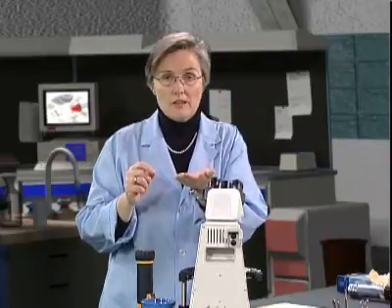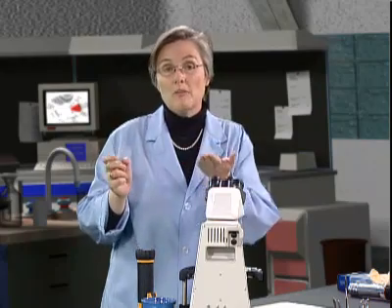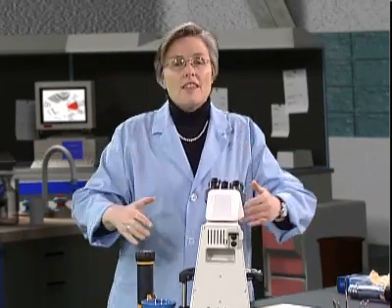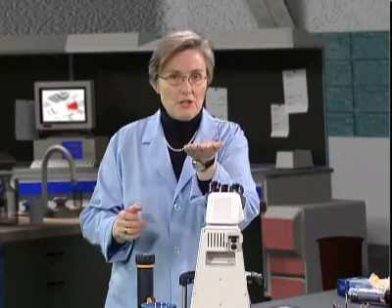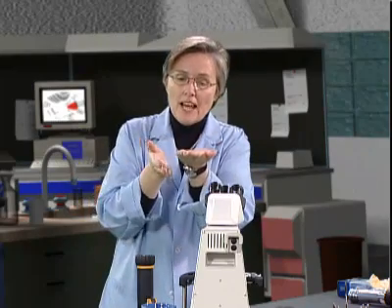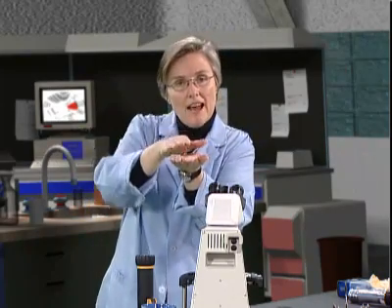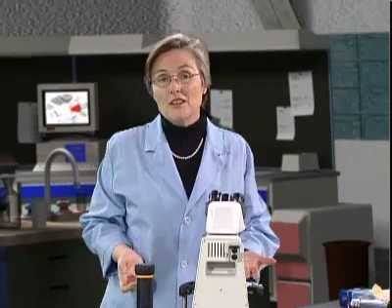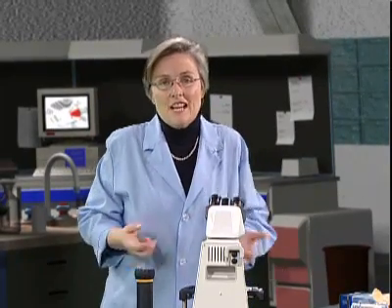Cyanoacrylate, or superglue, when it hits the air, polymerizes. And when something polymerizes, what it does is it rapidly repeats basic units. It forms a plastic. So think about this. We have oily residue on a surface. We put superglue fumes over the top of it. And literally what happens is a plastic coating goes on top of that oily residue. So that now all you have to do is apply black powder to it, dust it, and you have the fingerprint visualized.